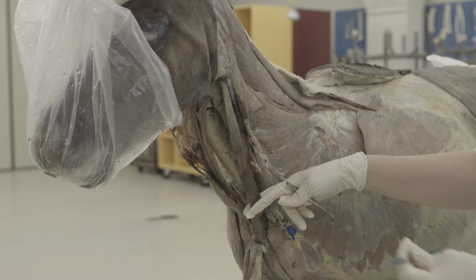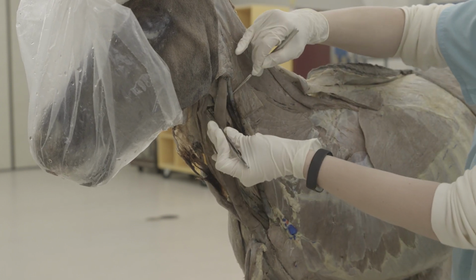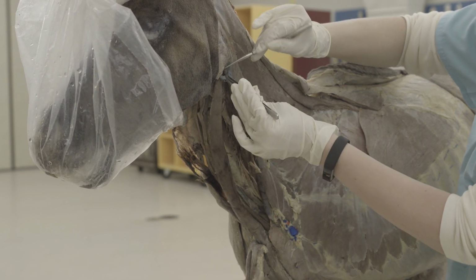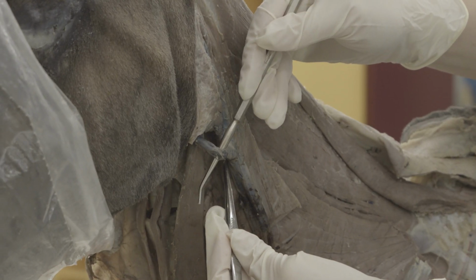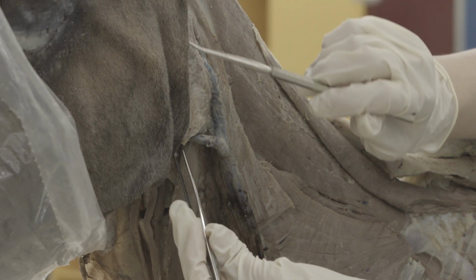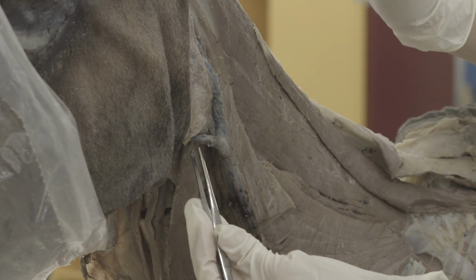So sternomandibularis has a long tendon, so when you move up towards the head, you'll trace the external jugular vein here and find where it has the branches of the linguofacial vein and the maxillary vein right here. So make sure you skin your neck far enough forward towards the head that you can see this.